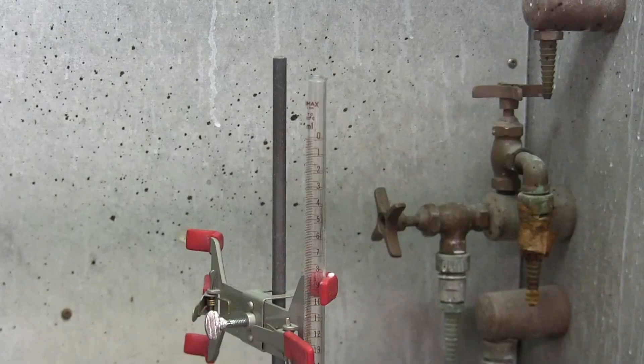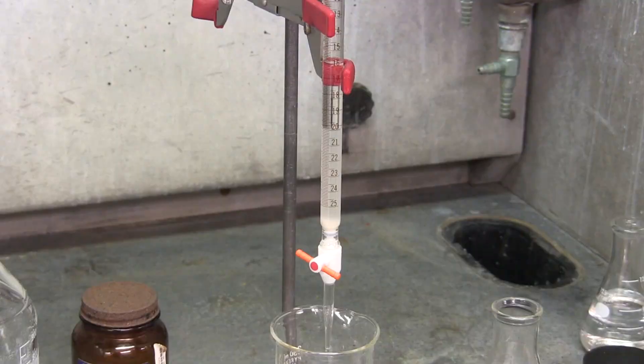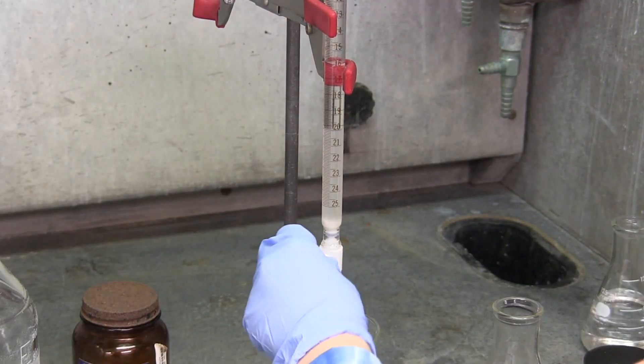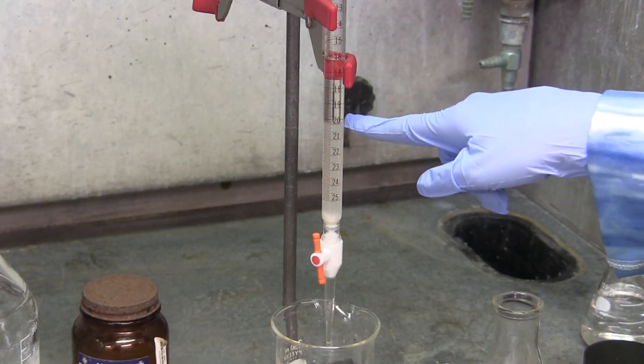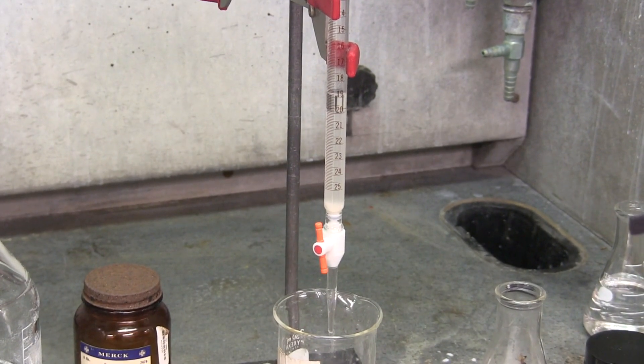The column is about 5 milliliters tall, as a too short column would not effectively separate the compounds and a too tall column would take too long for the elution. The stopcock is then opened so the solvent can drain to the top of the silica, and then closed.